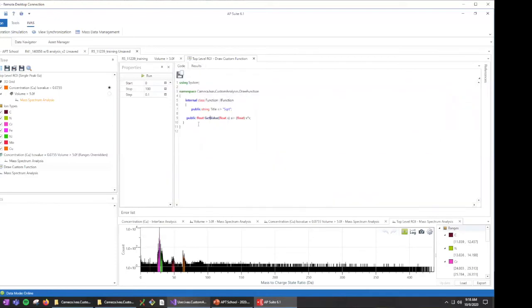Hopefully that shows you what you want, Dieter. I hope to have some better examples of ways you can use this scripting interface to do some things that actually interface with the ion data itself, as opposed to just drawing arbitrary charts. And good documentation. We're all hoping for really good documentation. I know, right?